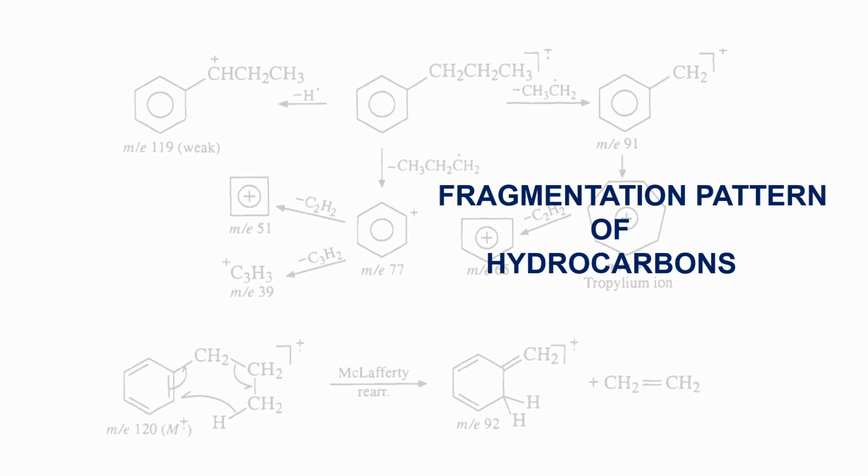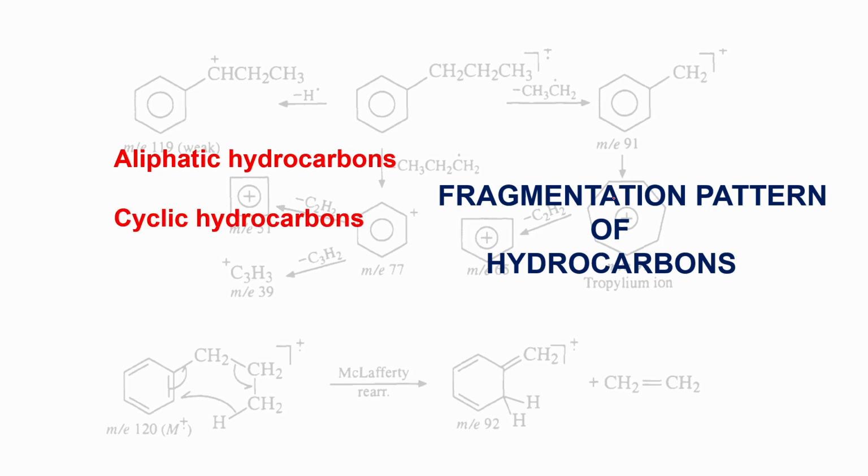In this video lecture, I will discuss the mass fragmentation pattern of hydrocarbons. This includes the fragmentation of all types of aliphatic hydrocarbons, cyclic hydrocarbons, and aromatic hydrocarbons. Let us first discuss the fragmentation of alkanes.